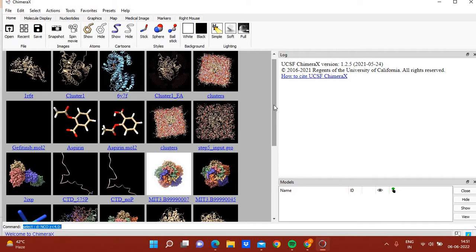When a template is not available we generally rely on ab initio, but ab initio has a limitation: it can't predict reliable structures of large proteins with more than 100 amino acids. AlphaFold is a very reliable program that gives you a structure and also tells you which part of the structure is accurate and which part is not.